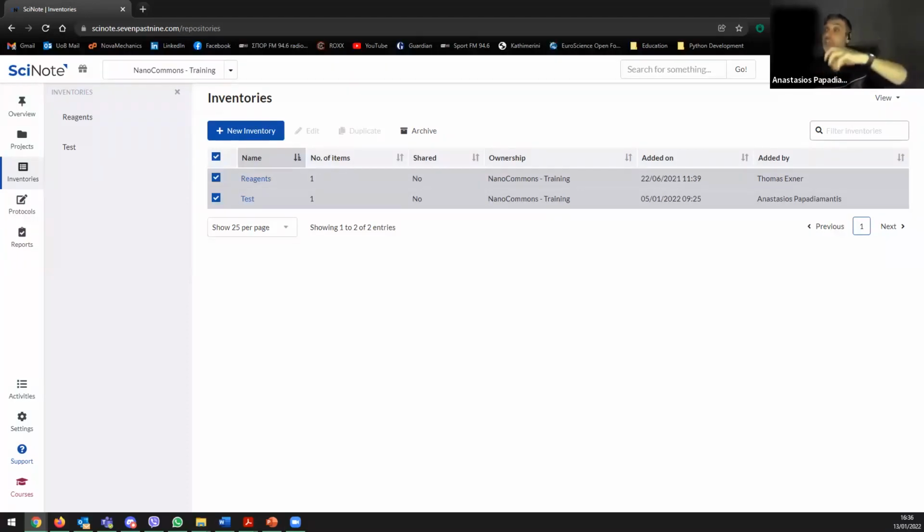But if you make any deviations within the project and the experimental workflow, those deviations will not be visible to people that are not assigned to this workflow. They will be visible only to the people who have access to the specific workflow. For transparency reasons, all the people involved should be able to see any deviations, because you do this experiment with these people so that you can get results together.